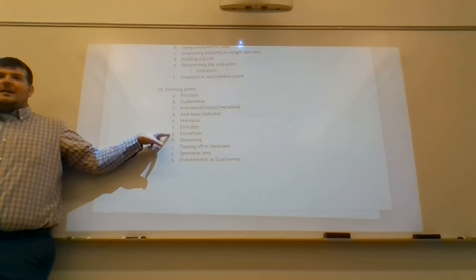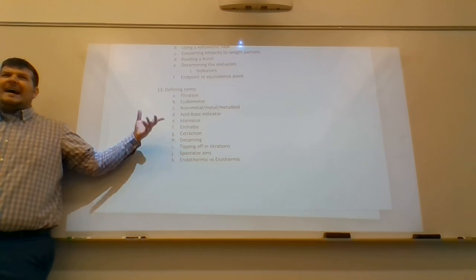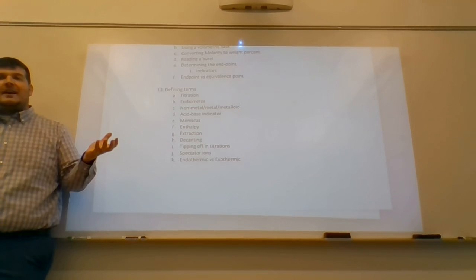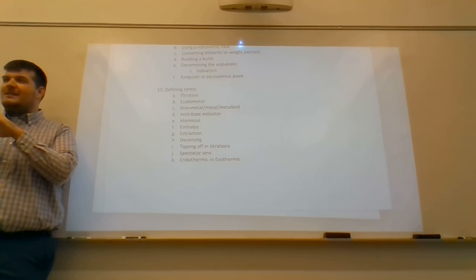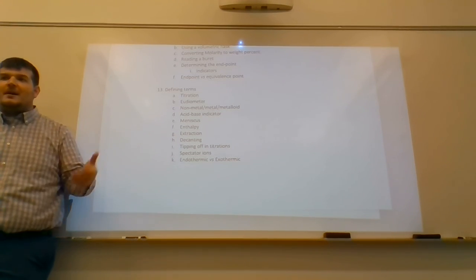When I teach organic chemistry, one of the concepts that we do is extraction. We pull out caffeine from iced tea, and we calculate how much caffeine is there. Or we can pull out trimyristin out of nutmeg. It's basically an essential oil. We pull oils out of cinnamon, nutmeg, whatever you want.